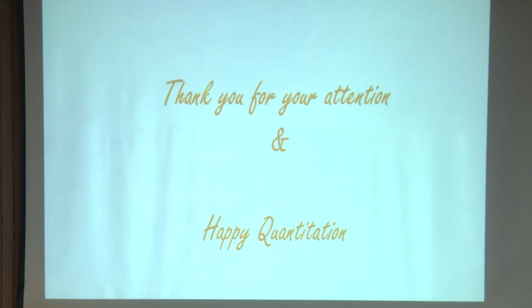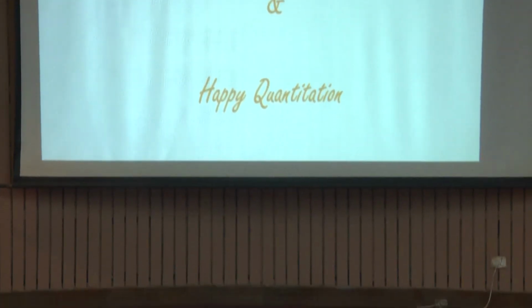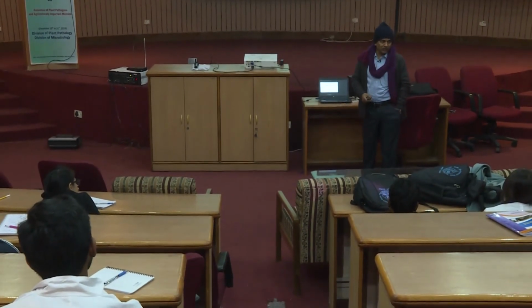You can ask me questions related to that. Although the equipment like the one you used can be used for absolute quantitation, understand there are new methods of looking at the data, or quantifying the number of gene copies present in an environmental sample. So you should improve regularly rather than sticking with only one method. Several new ways of statistical analysis are also coming up, and of course you should have more replications to avoid failure and to improve the accuracy and precision of your data. Any questions now?